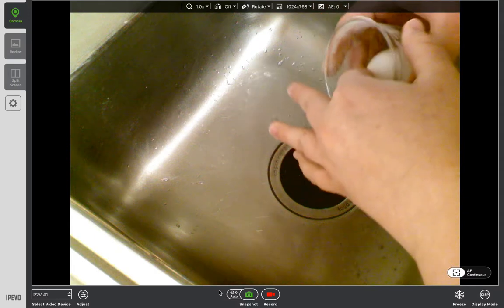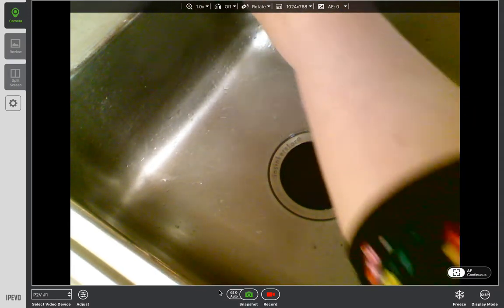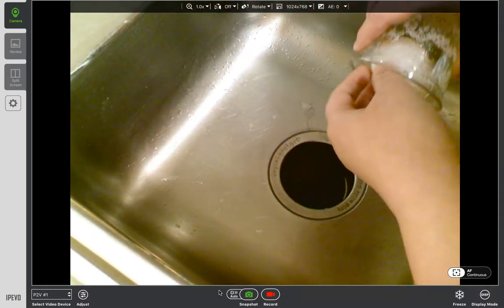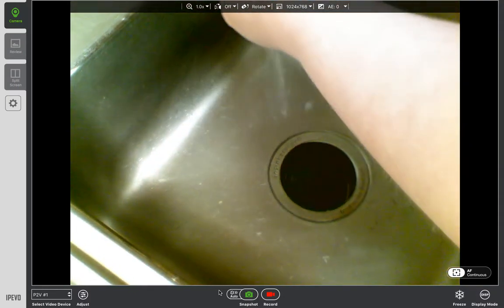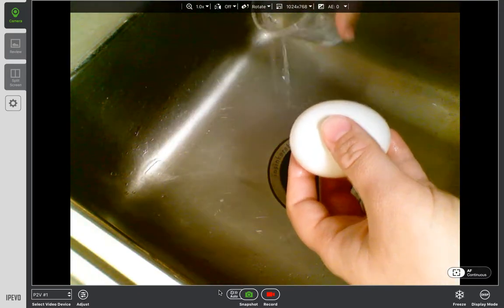Because I don't want to touch this tons. I mean, it's not so fragile that you're going to touch it and it's going to die or completely undo itself. I just try to be very, very careful with it. All right, give your cup a good rinse out.